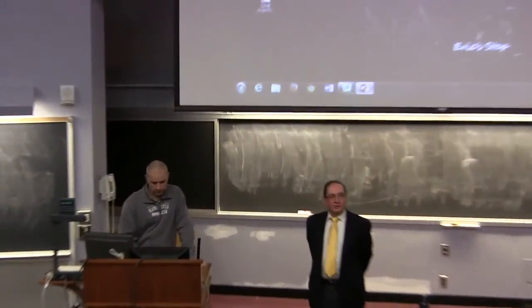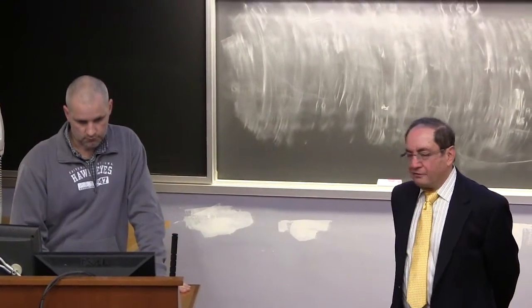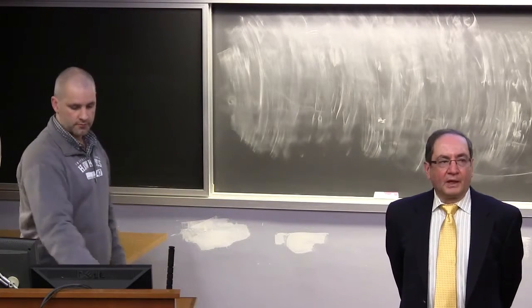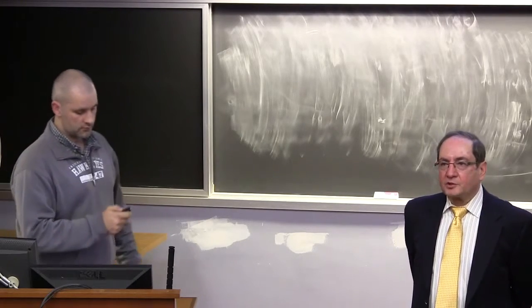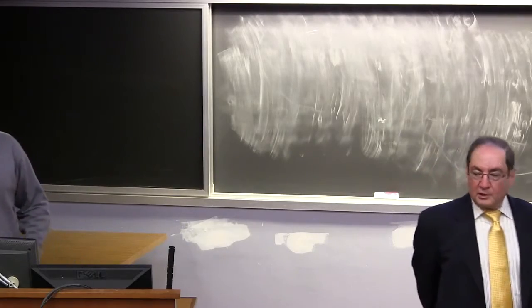AFM. Since one of the sets of instruments we have is AFM upstairs, I thought it would be nice to have a few words about AFM. After the presentations, anybody who wants to go to the optical spectroscopy lab or see the AFM instruments and talk to us, we'd be happy to follow up with you.